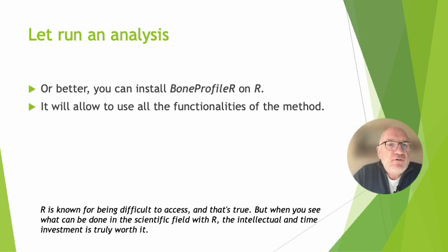R is known for being difficult to access. That's true. I cannot say something else. But honestly, it's worth the effort. You will see that with R, you can do many different things, and the intellectual and time investment is really worth it.